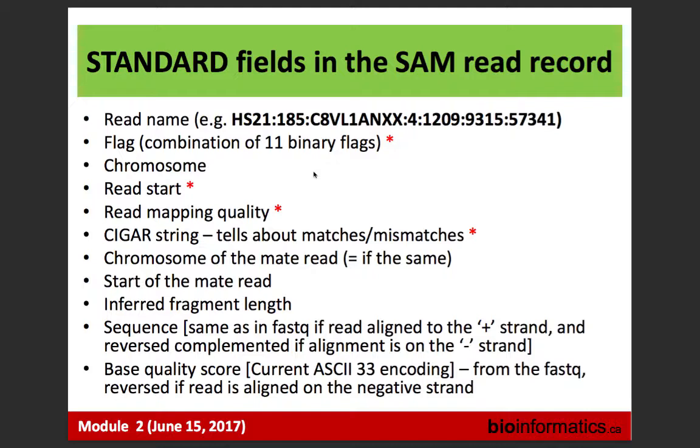What is absolutely necessary to know when we have an alignment? Coordinate. What else? Yeah, that's coordinate. Quality of alignment. Mismatches, whether there were mismatches or not. What part of the read was aligned? For example, sometimes an aligner says, sorry, I can't align these first 10 bases. I soft clipped them. I kind of masked them and started from base 10. So this type of information is contained, and we will go through it in the practice.